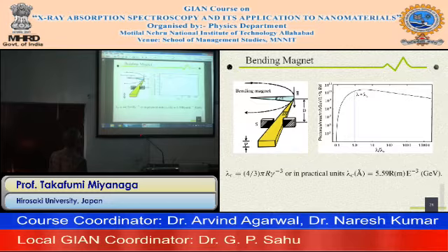And here is the top of the peak, the critical scattering wavelength. So it has such structures. Of course, this side is the low energies, and this is the high energies. So it's a critical energy.